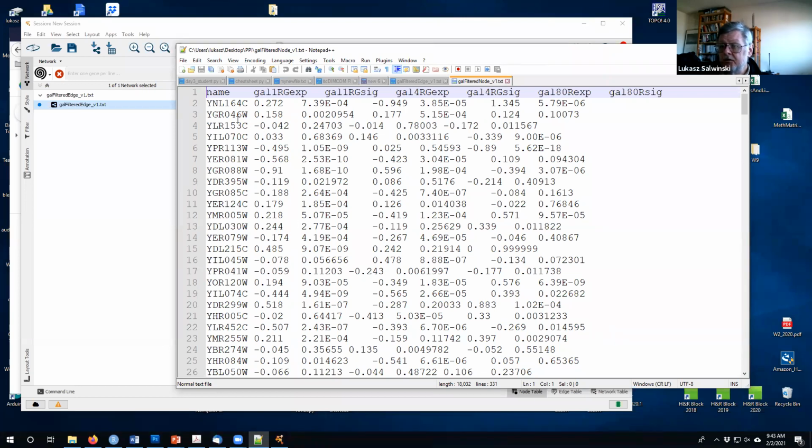In this particular case, it's taken from a... on a Mac. Let me check, but I'll have to. Okay, I've got to log in into Mac 2529, unless there's someone who knows. Let's go to Cytoscape.